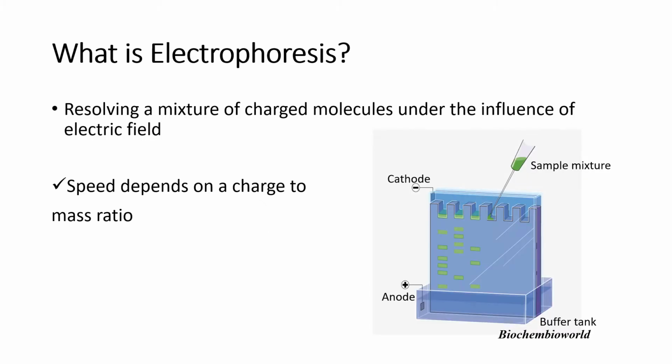Basically, what is electrophoresis? This is the technique which is used to resolve a mixture of charged molecules under the influence of an electric field, where these charged molecules can be amino acids, proteins, nucleic acids, that is DNA or RNA.